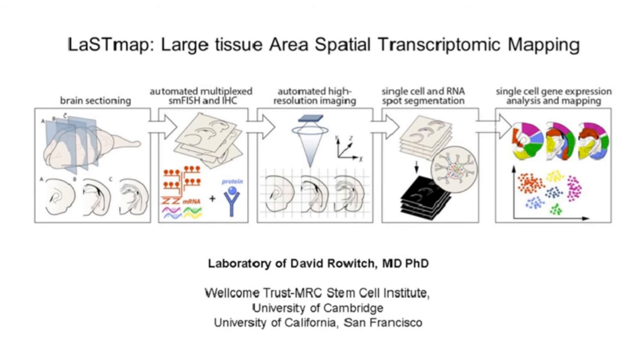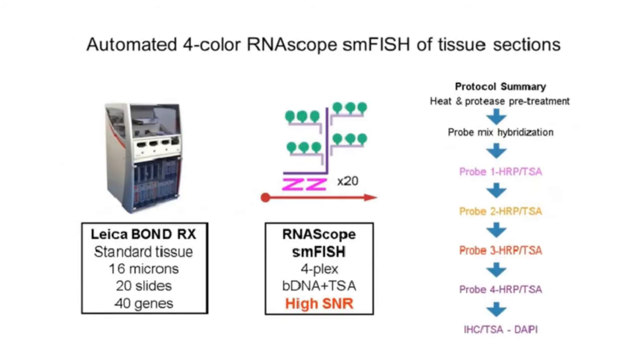We use an image analysis program that can handle large data to segment single cells in our image data, and count RNA puncta within each cell. Last, we can go into this image data, manually identify different brain regions, and analyze single-cell regional expression patterns across the brain tissue. So now I'd like to quickly run you through some of the technical specs of this pipeline.